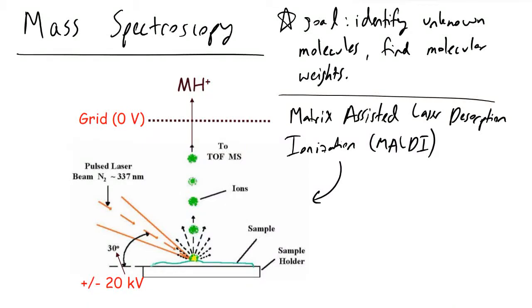Let's say I give you an unidentified compound and I want you to identify it, and tell me what the molecular weight of that compound is. How are you going to do that? In lab, people will turn to instruments referred to as mass spectrometers, which will allow us to accomplish this. And the theory behind it is pretty interesting.